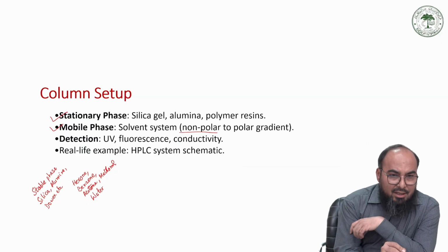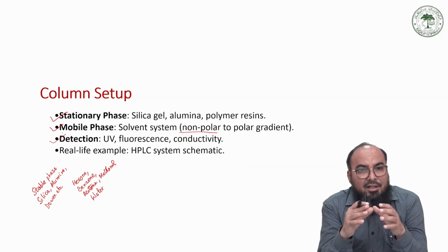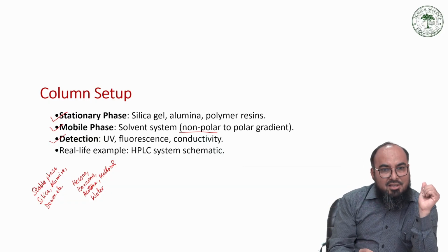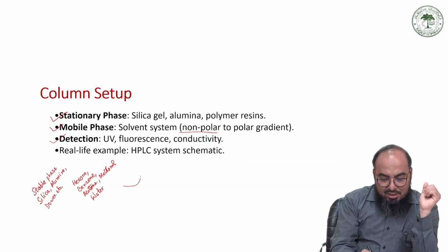Now the important part is the detection. We have to use a detector because it is the detector which records the signal with regard to the separation of peaks.